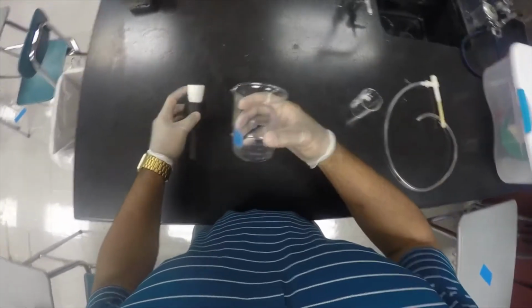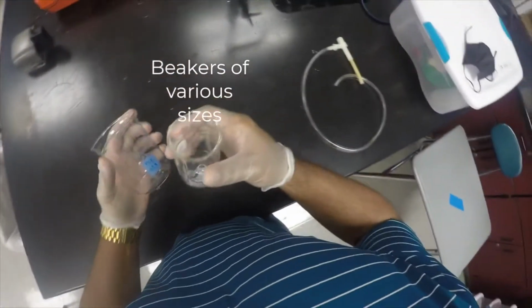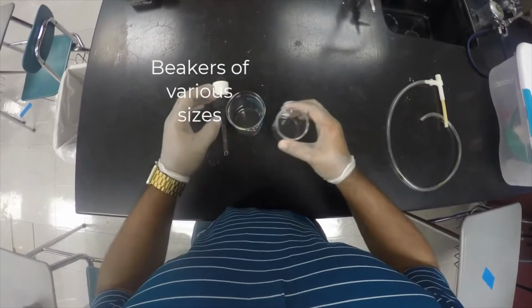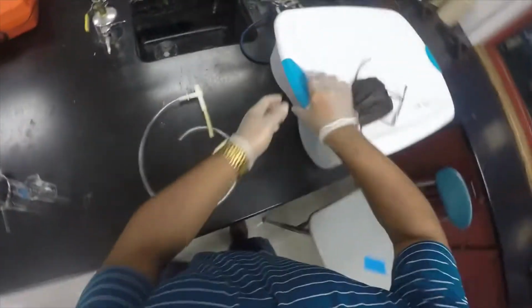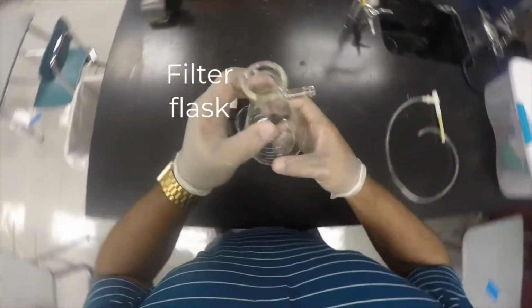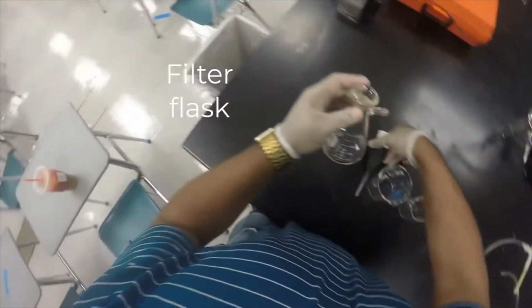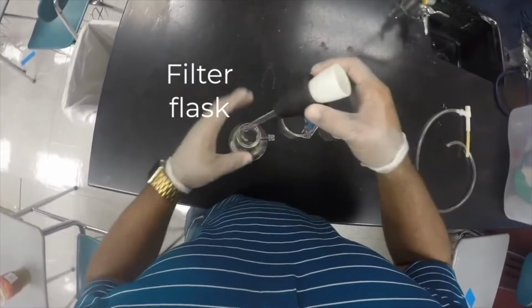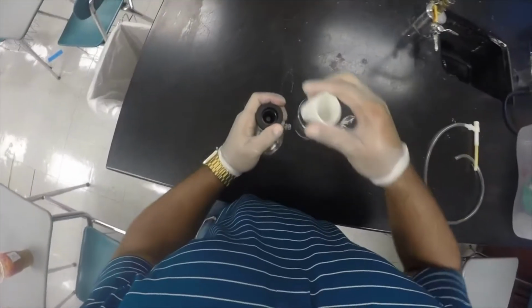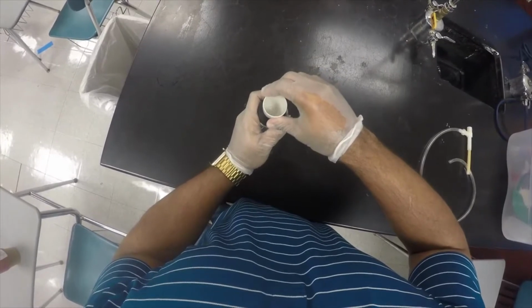We'll be using standard beakers. We'll use 2 sizes, and then we'll use something called a filter flask. Let me show you this real quick. This is a filter flask, and the Walter adapter I showed you before sits inside of the filter flask, and the Gooch crucible sits on top of that.